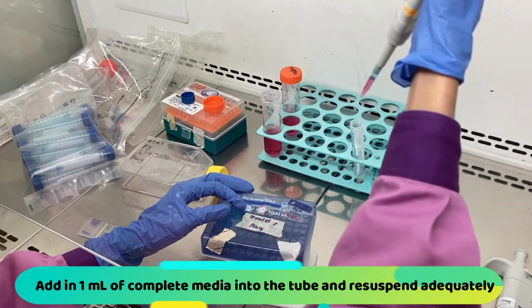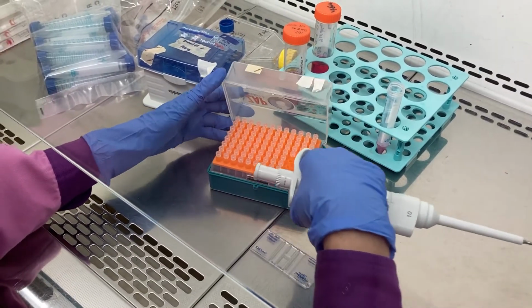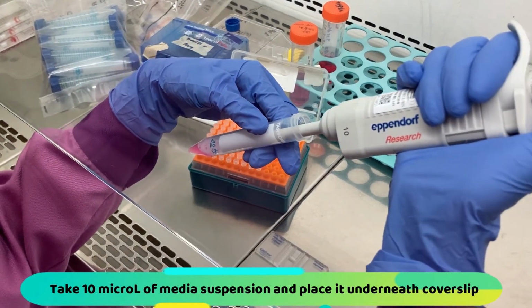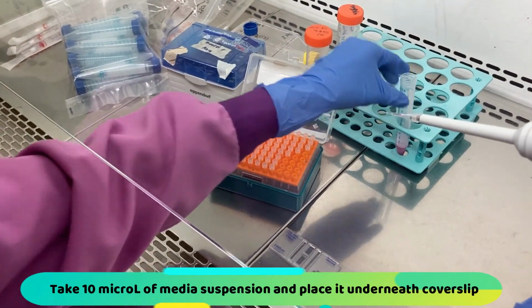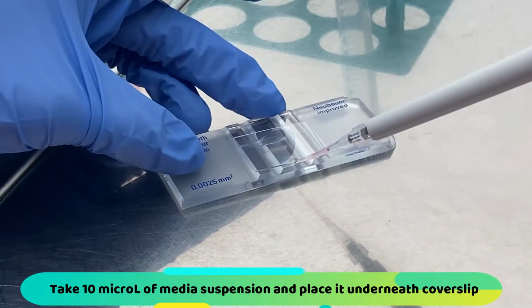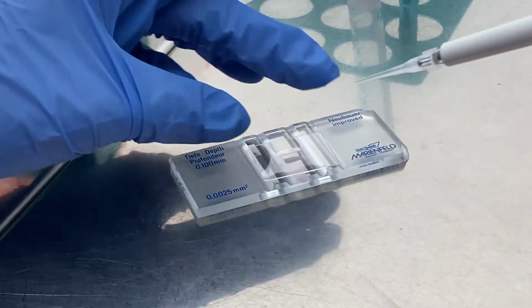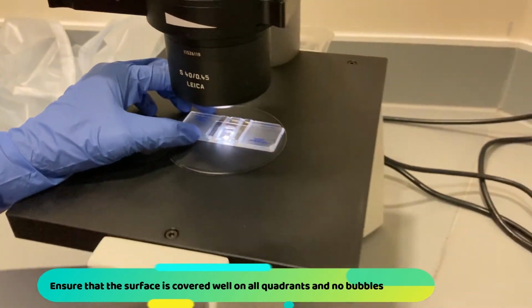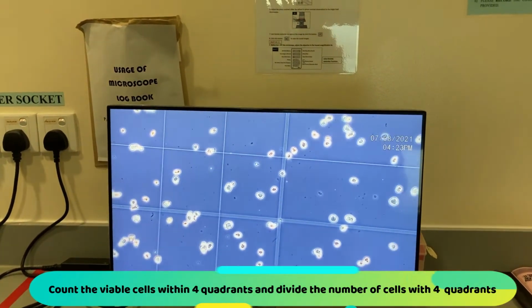Add in 1 ml of complete media into the falcon tube and resuspend adequately. Next, take 10 microliter of media suspension and place it underneath cover slip. Ensure that the surface is covered well on all quadrants and no bubbles in between the glasses. Count the viable cells within 4 quadrants and divide the number of cells with 4 quadrants.